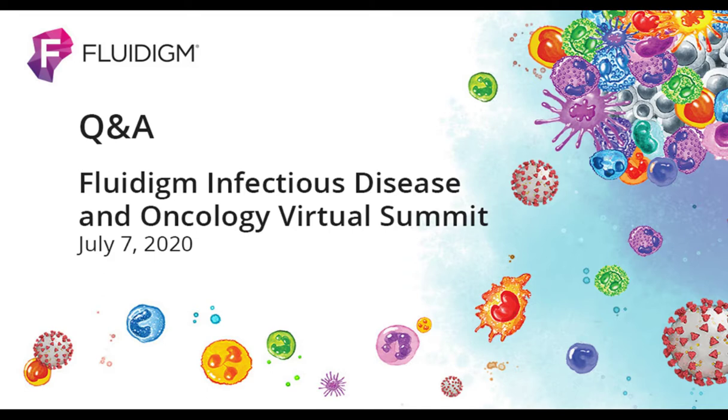Now, Shelley, we do have a question for you. How many patient samples can you run per batch? We run 192 in the IFC chip. We do add 4 controls per set of 96. So for just the patient samples themselves, it'll be 184.